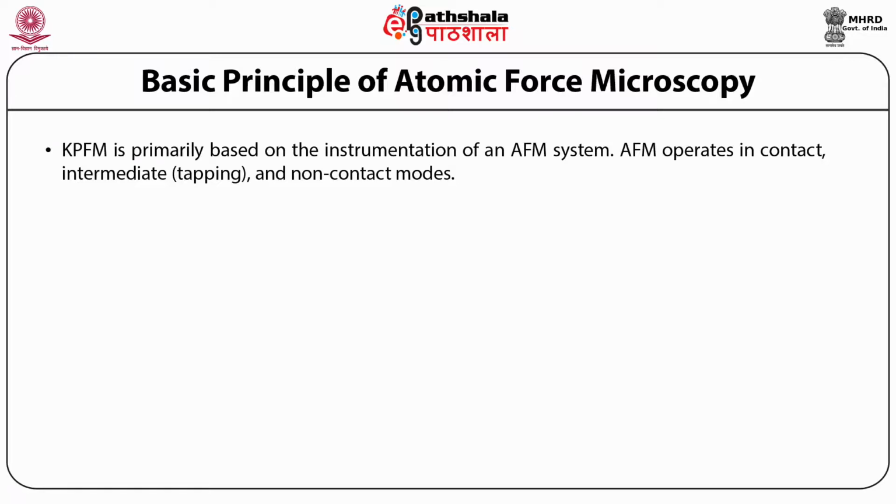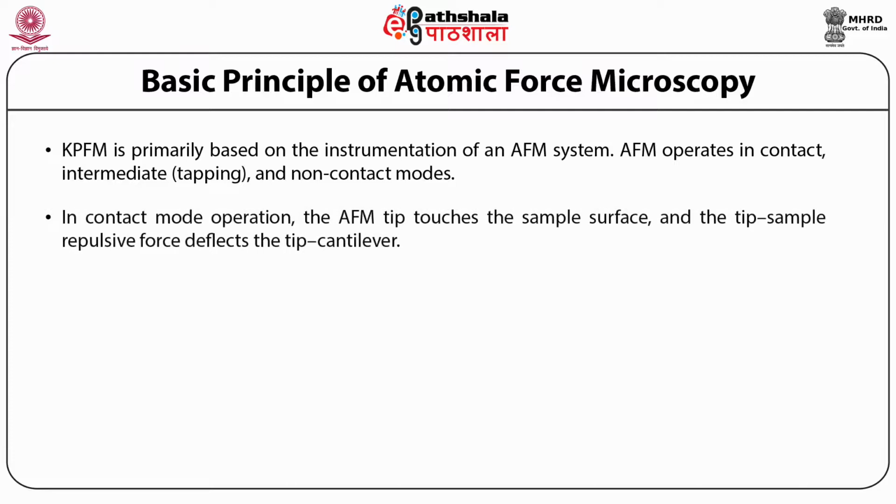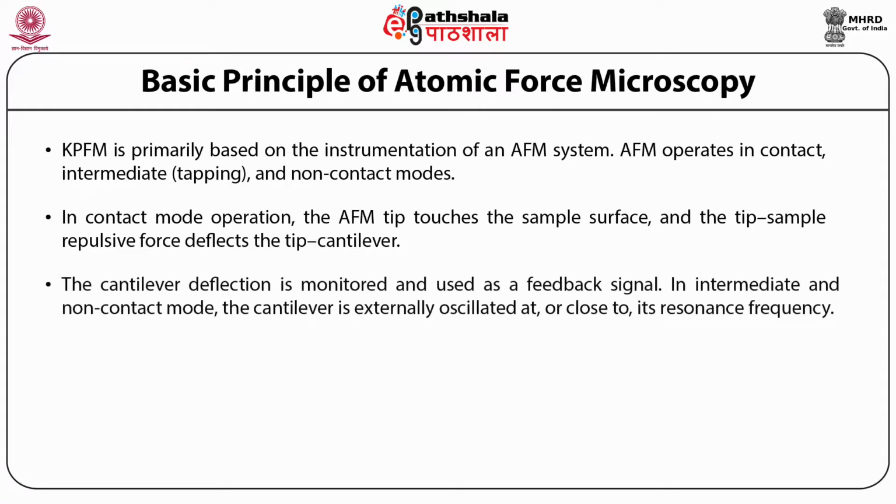AFM operates in contact, intermediate, that is tapping, and non-contact modes. In contact mode, the AFM tip touches the sample surface and the tip sample repulsive force deflects the tip cantilever. The cantilever deflection is monitored and used as a feedback signal.